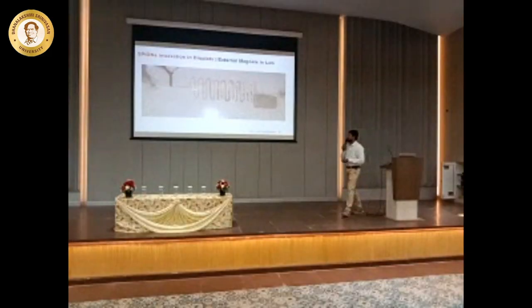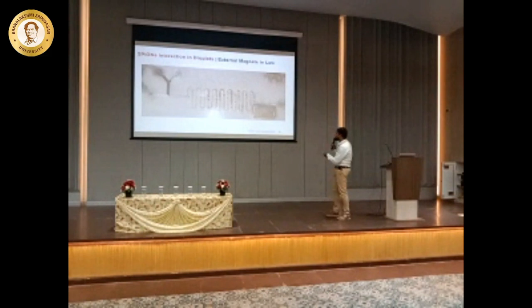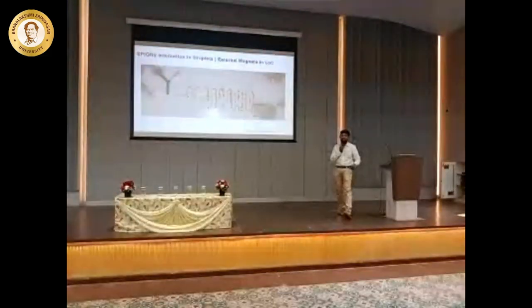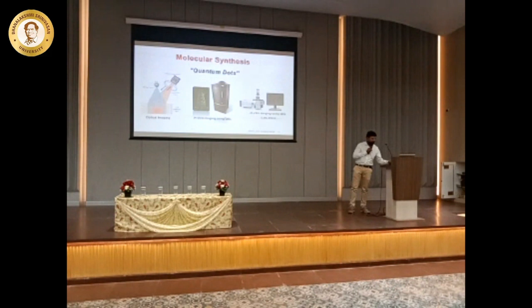So can you see here? These are all iron oxide nanoparticles. We flow them through the channel. What's happening here? I keep a magnet here. See the droplet here and see the droplet here, what is happening. I'll just go back and come. Oh, sorry.